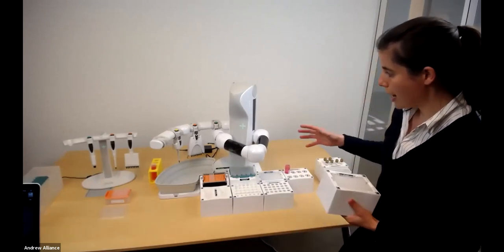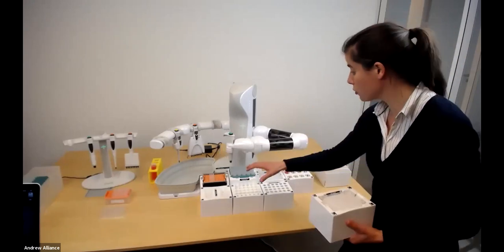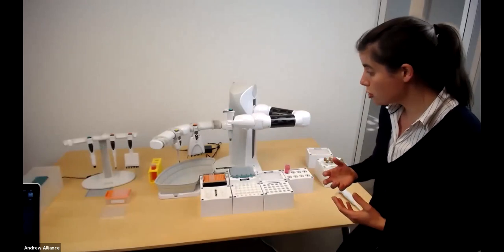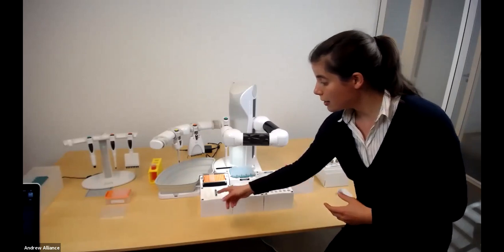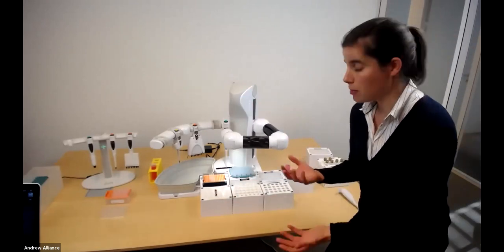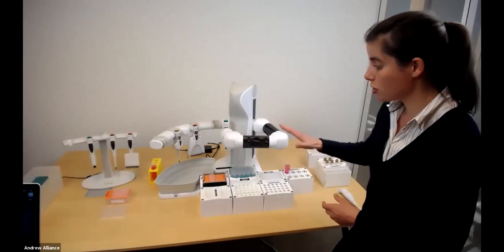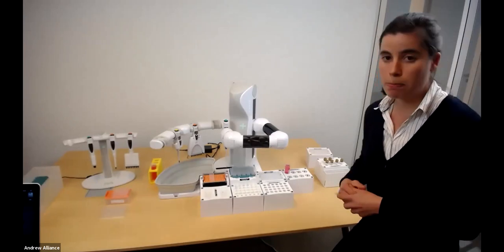And without further ado, Andrew just checked the whole lab bench. Everything's good to go. We have enough tips. We have our consumables. Everything's ready. Remember the first step we indicated in the protocol was going from a 50 ml tube, 5 ml, into a reservoir. So Andrew took the right pipette, in this case the 5 ml pipette. He's now checking, because we just started the experiment, he's checking the tip to make sure he knows the height of that tip. And then he will go to a 50 ml tube and start the pipetting action of 5 ml.